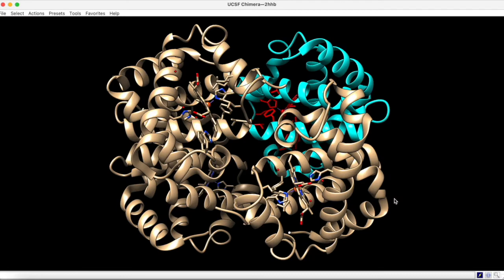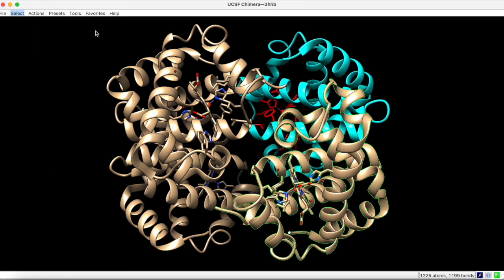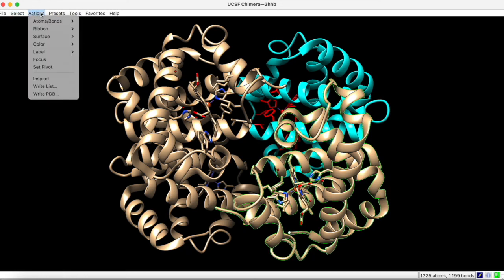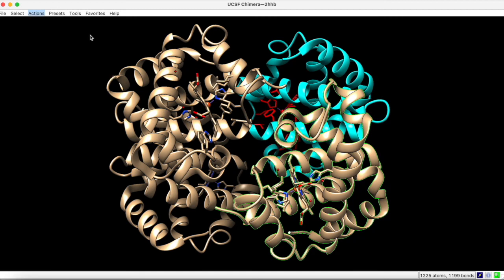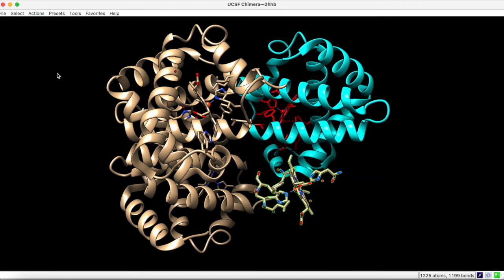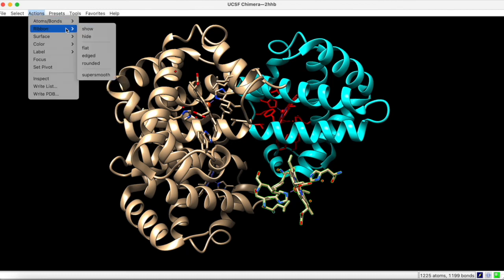Let's say you wanted to examine this same heme group close up, but the surrounding ribbon is kind of getting in your way. To solve this problem, you can start by selecting the entire chain B. Then, under Actions, you can choose Ribbon Hide. Now, only the heme group and some surrounding residues are shown. You can undo this operation by clicking Ribbon Show.